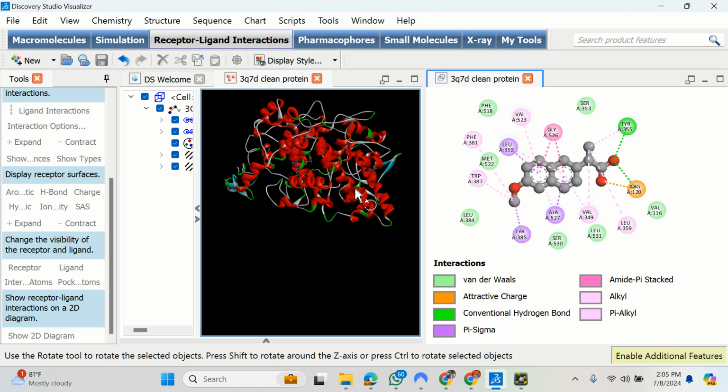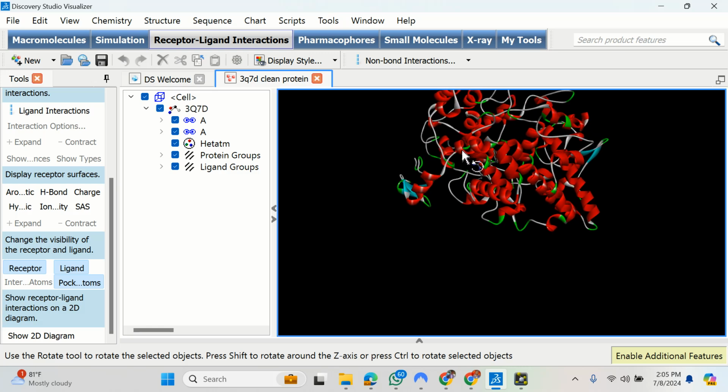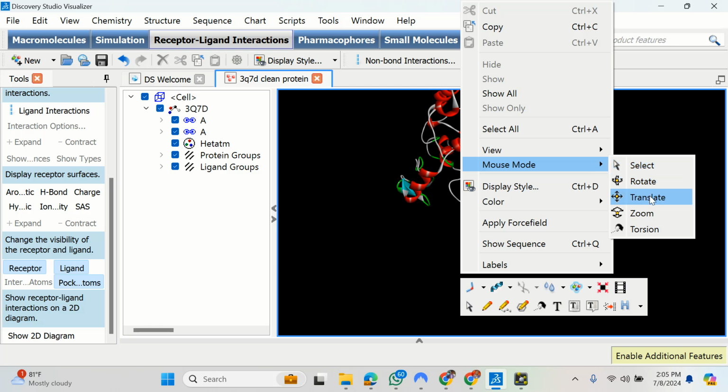So if you go to the structure of that particular compound, you're going to find something like that. I've saved this. This is the compound, and this is the amino acid. I'll show us about customization later. So if I zoom this further, let me show what we just noticed. Okay, I'll go to my display mode and then I will zoom it.